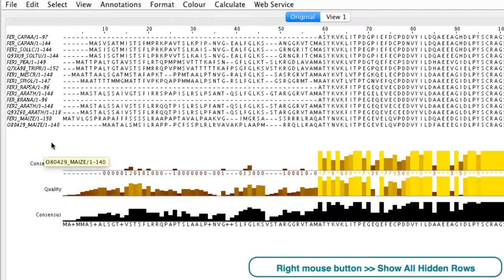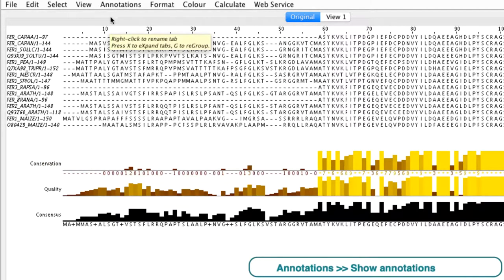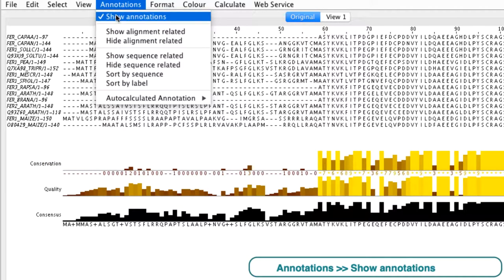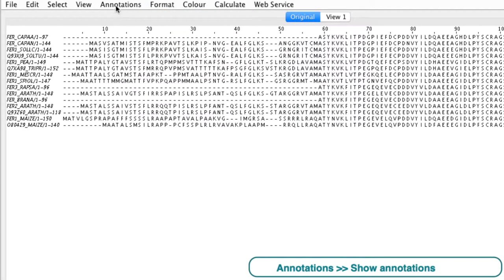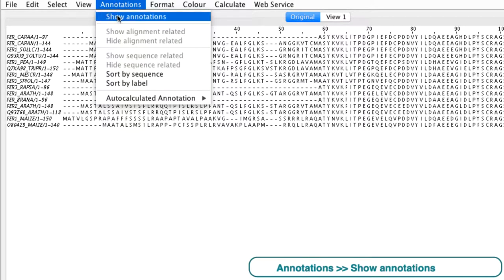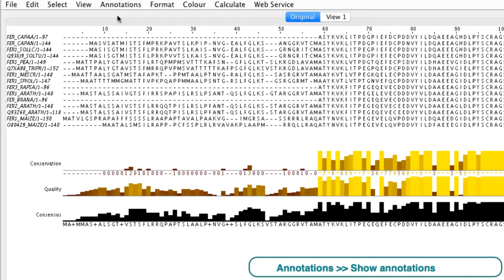All annotations can be toggled on or off by going to the annotations menu and then selecting the show annotations option.